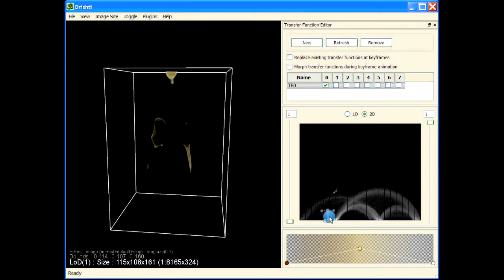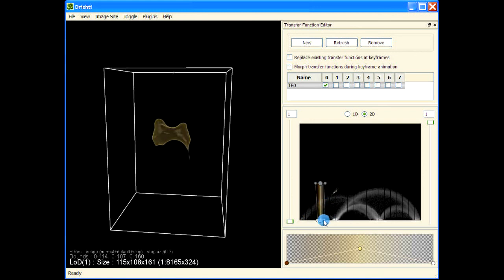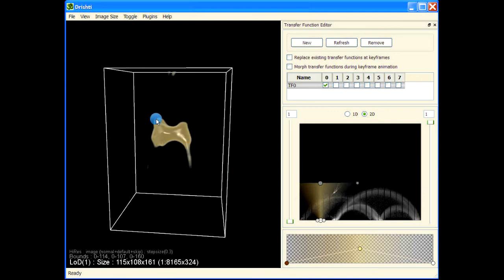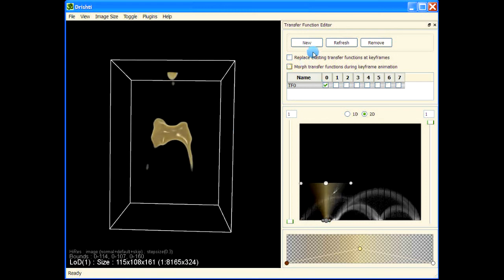There is also a tiny arch here. Let's show the interfaces — this is one interface. I'm using shift key and left mouse button to increase the size of this widget. When the spine here is smaller you get a very sharp edge for your surface, and when I increase that you get a very easy, hazy boundary. Depending on your needs you can have a sharp or a hazy boundary.